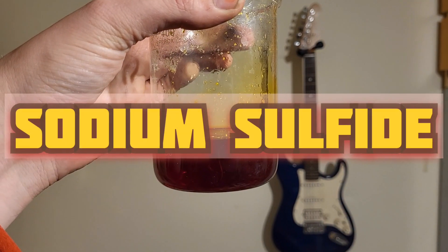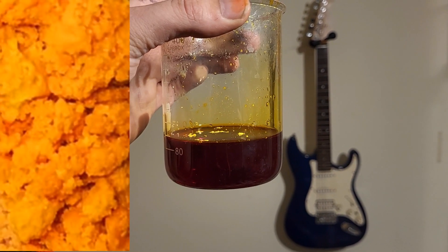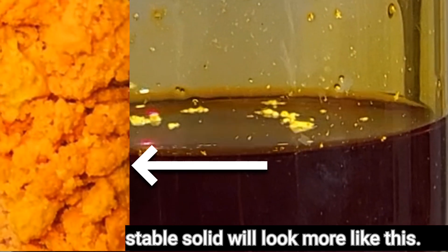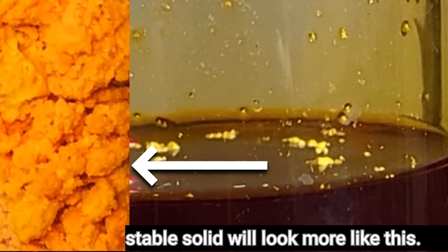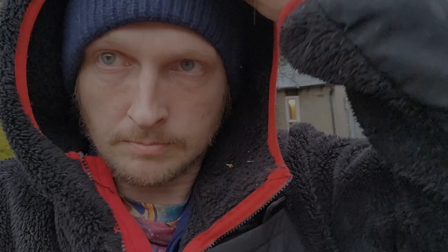This needs to be dehydrated. This will take several weeks. I'm going to use a vacuum desiccator. I hope you enjoyed the video.